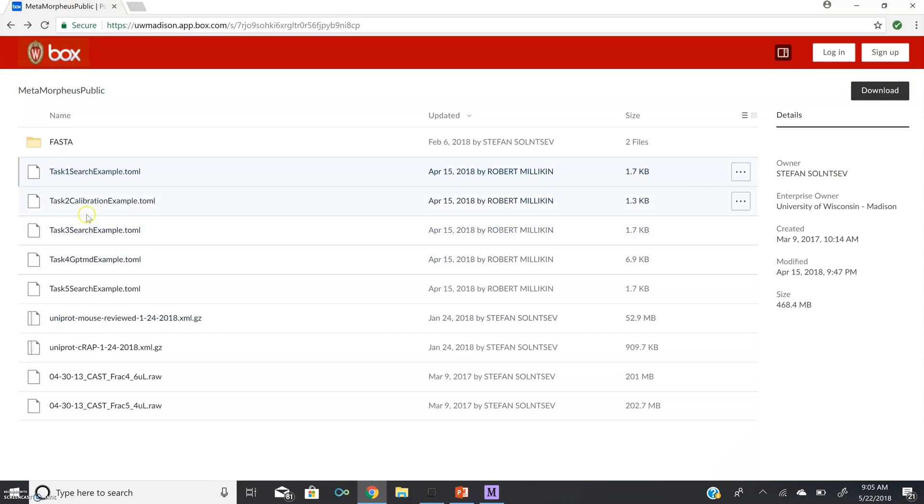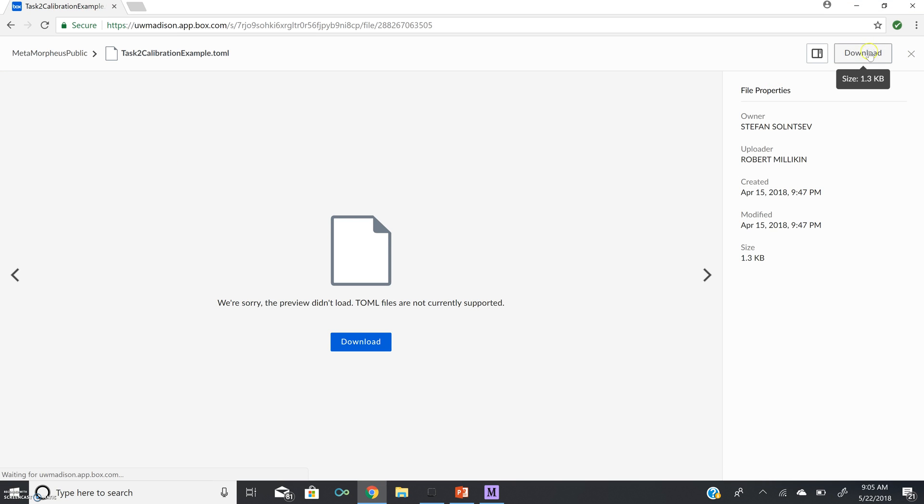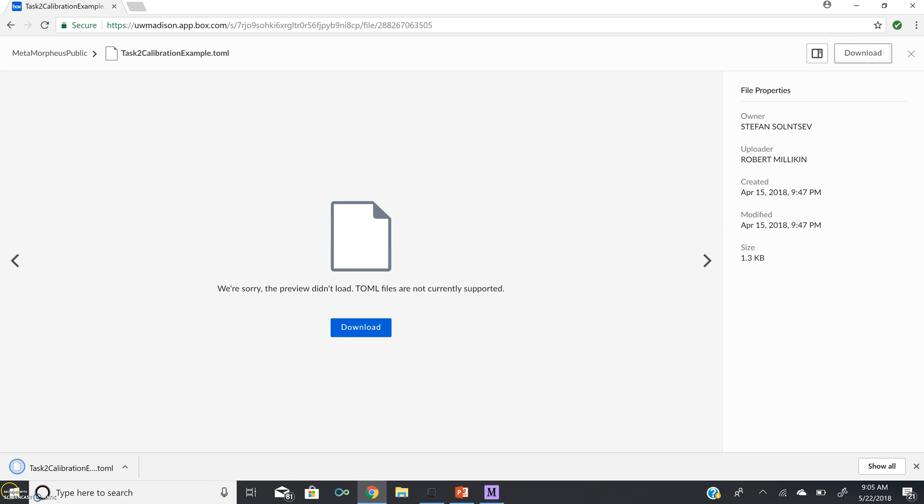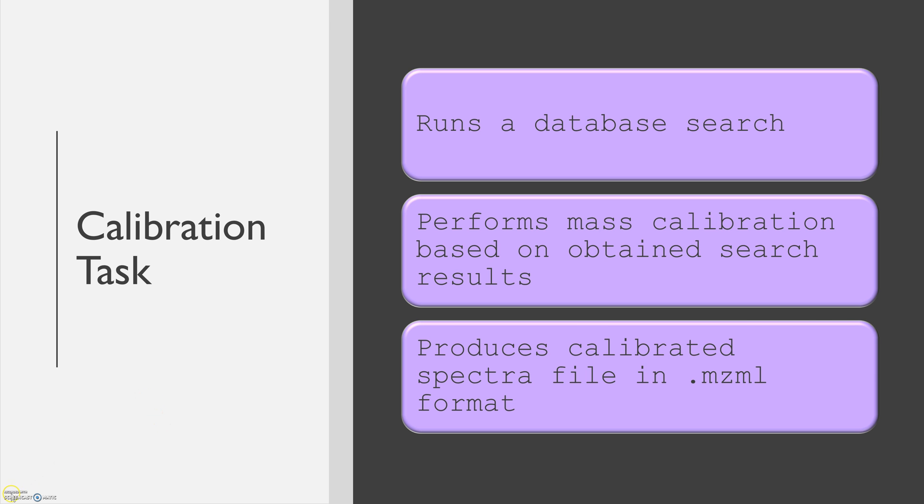Next, we're going to download task 2, a calibration task example. A calibration task runs a database search, but then performs mass calibration based on the obtained search results. This task produces a calibrated Spectra file in the mzml format.